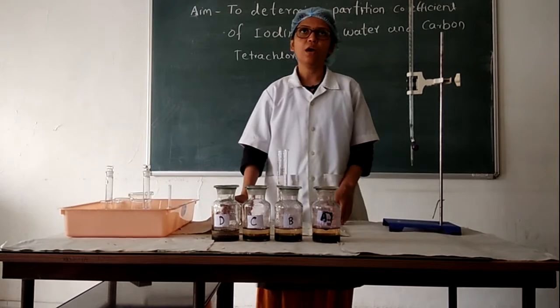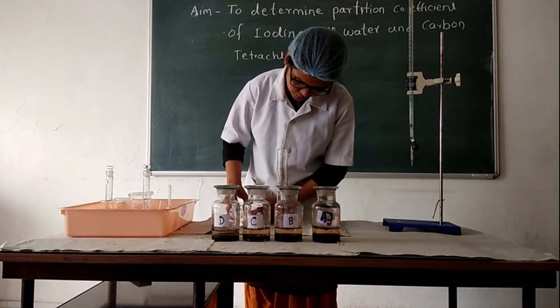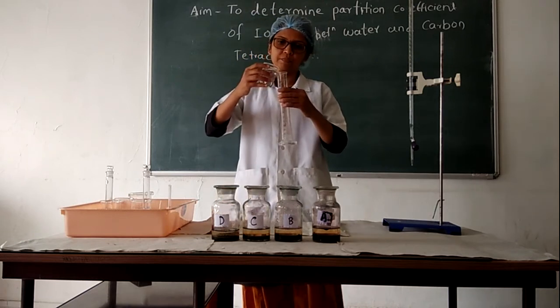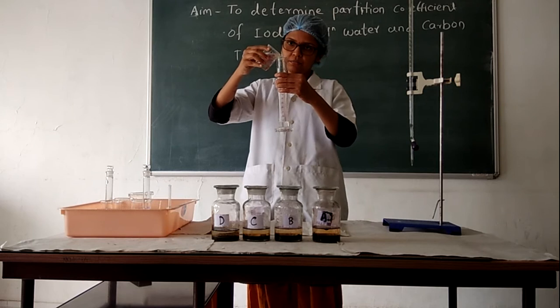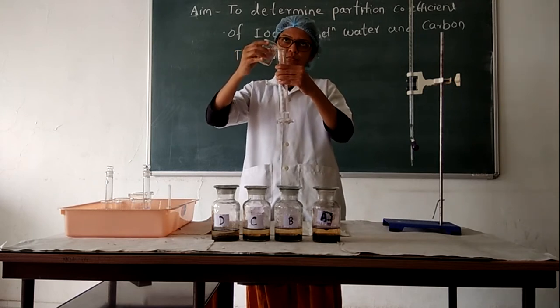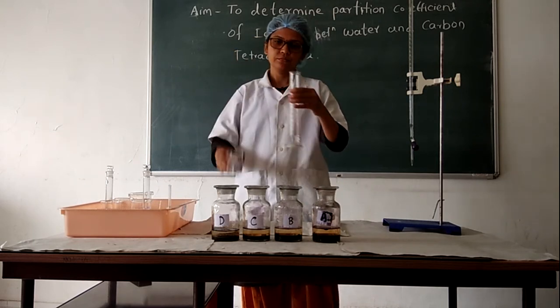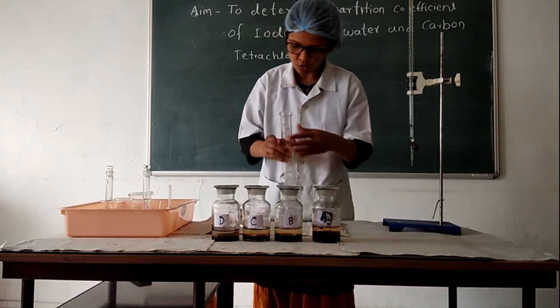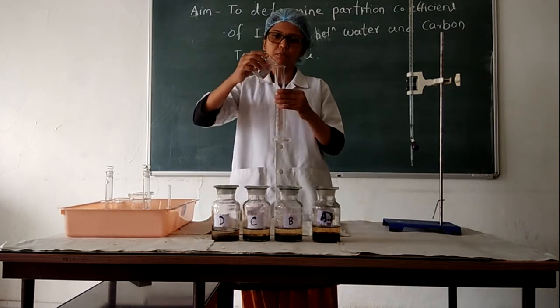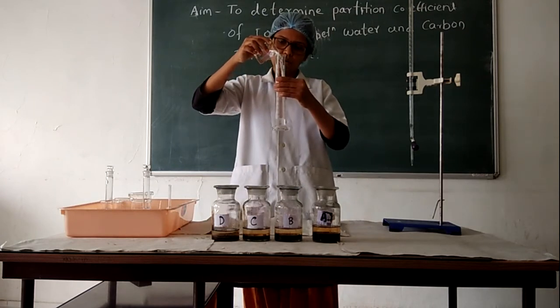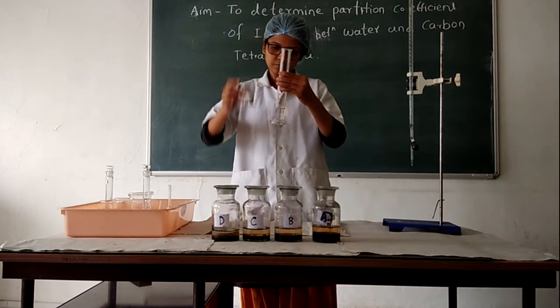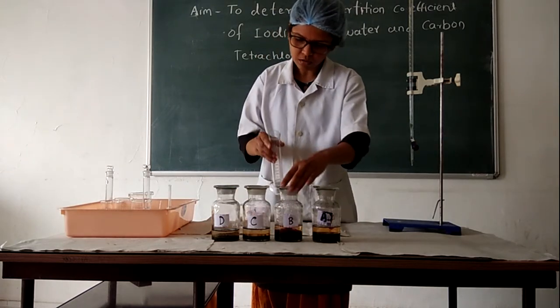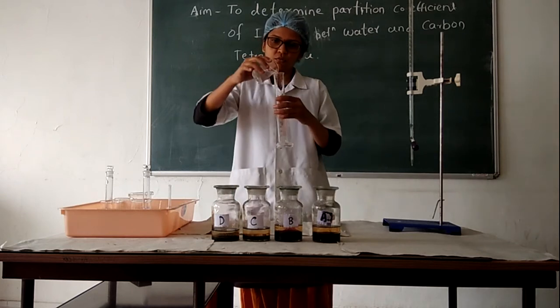Now I am adding carbon tetrachloride in each bottle. The quantity for bottle A is 10 ml, for bottle B is 20 ml, for bottle C is 30 ml, and for bottle D is 40 ml.